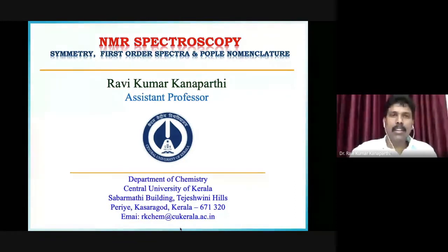And then we will also try to understand what the different order spectra are. There are three different order spectra: for example, zero order NMR spectrum, first order NMR spectrum, and then second order NMR spectrum. So there are three different types of NMR spectra. Basically any given NMR spectrum is classified into one of these three. It can be zero order, first order, or second order.